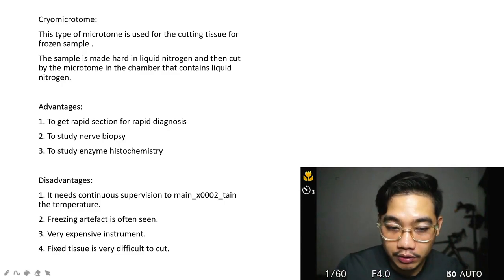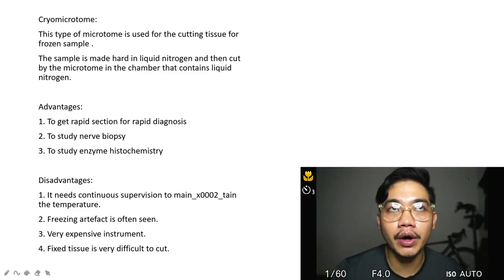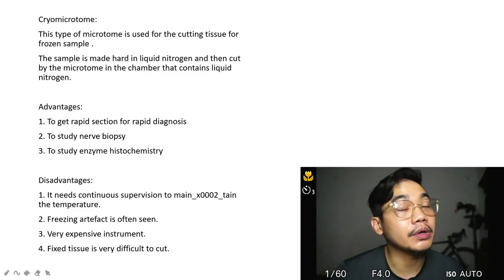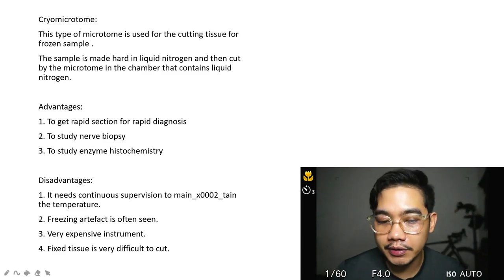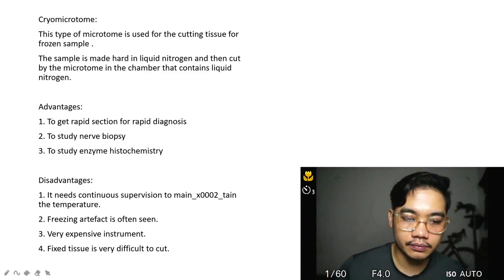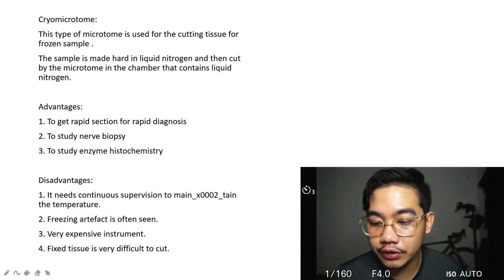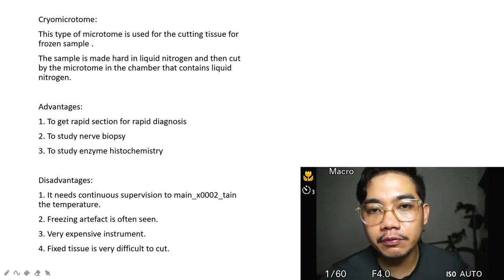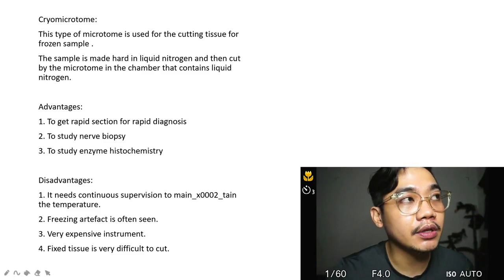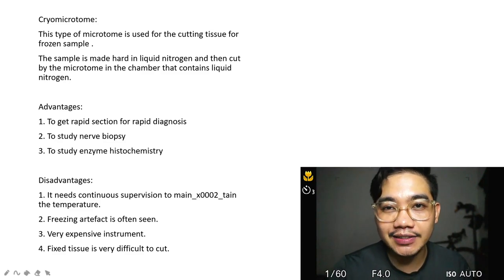It's a very expensive instrument, no? That cryostat is like one Pajero, it's very expensive, and fixed tissue is very difficult to cut in frozen section. You really need to submit fresh tissue for frozen section, meaning no formalin, no alcohol, as is where is.